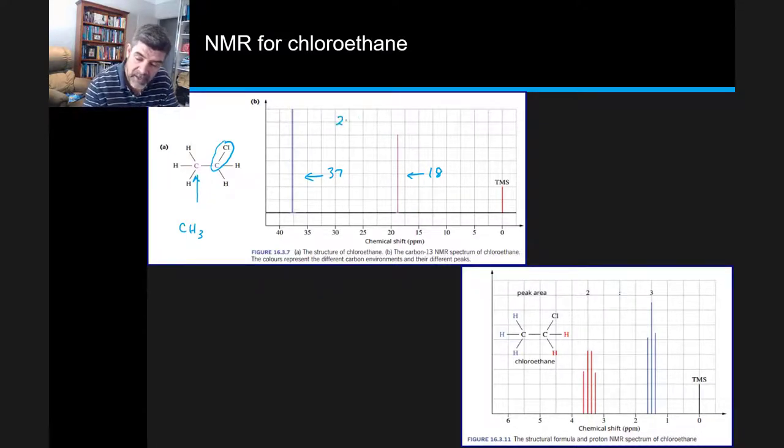Two peaks means we know that there are at least two carbons, two plus carbons, and in this case there are only the two.